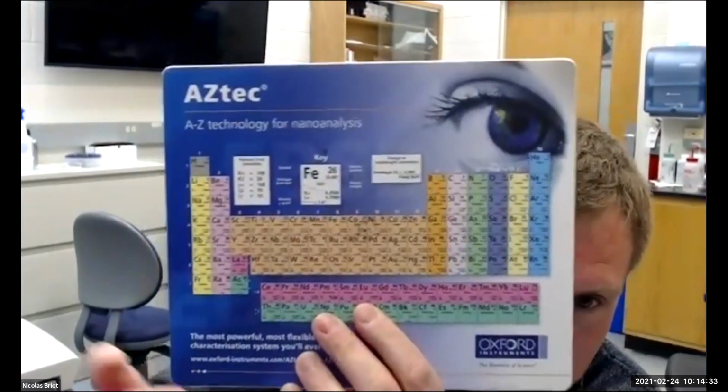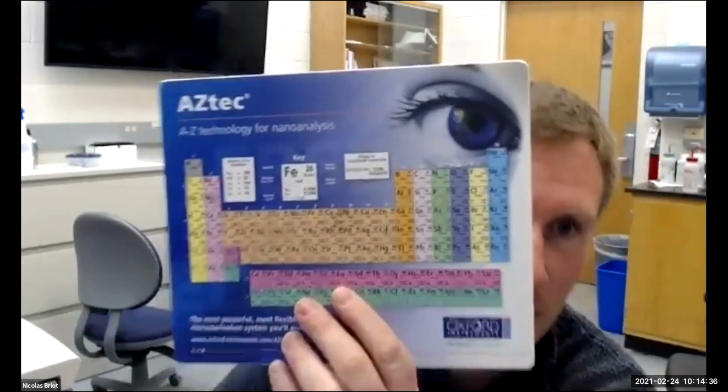Okay. Let me see if I can have the chat pop out, because I didn't see the chat earlier when you told me I wasn't showing the screen. Now I can see it. I need the info because I'm using that right now. I'm going to look at the elements you mentioned. I'm going to check the energy of the expected X-rays, and that's going to guide me in the selection of the incident electron energy, right? If you had a piece of metal, I could put the maximum voltage to be sure to excite everything, okay?